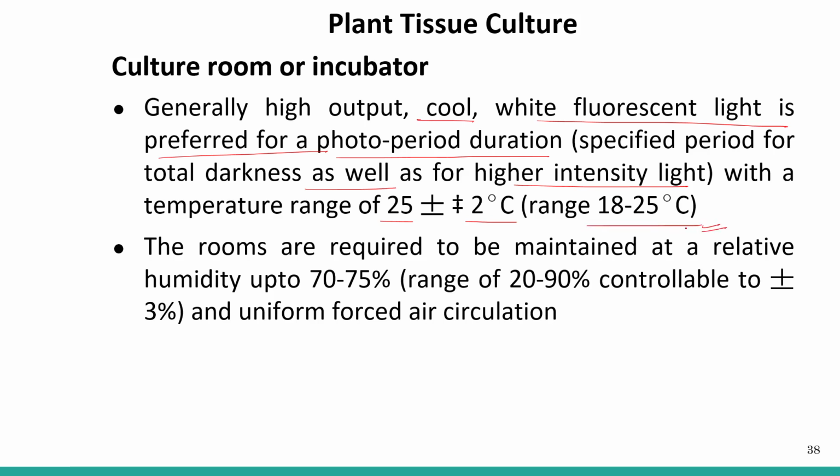This incubator is very specific for the maintenance of light as well as temperature. The rooms are required to be maintained at a relative humidity of 70 to 75%, within a range of 20 to 90%, controllable to plus or minus 3%, with uniform forced air circulation. So air circulation, humidity, light and temperature should all be proper, and maintained for 24 hours.